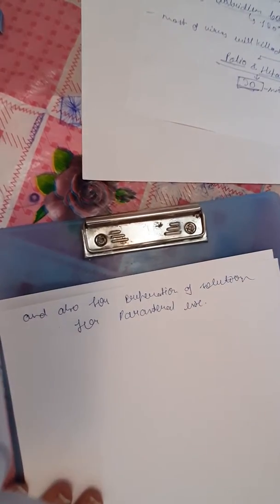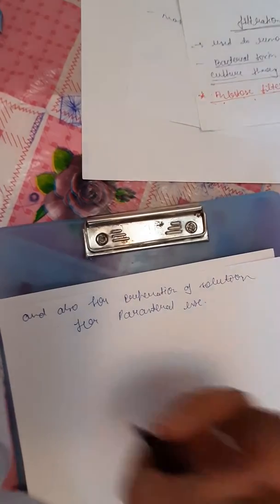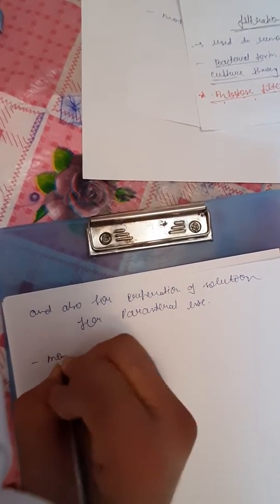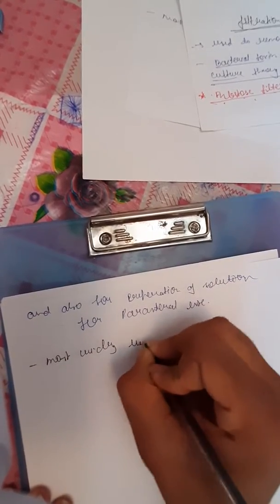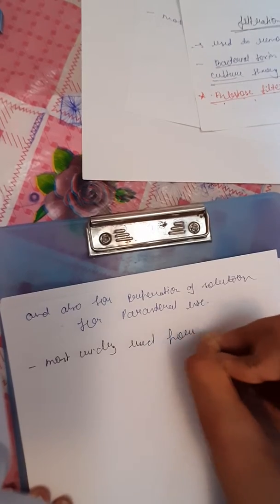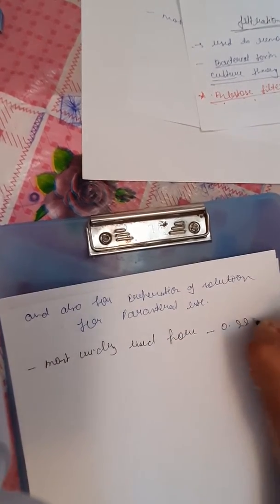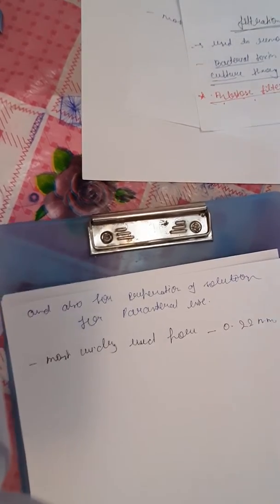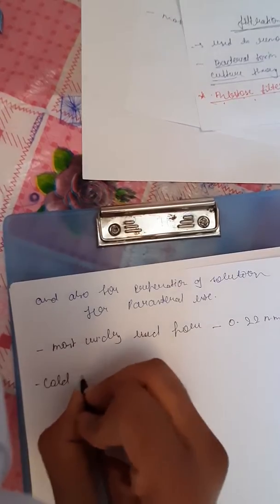And one thing is there, that the most widely used pore size is 0.22 micrometer.